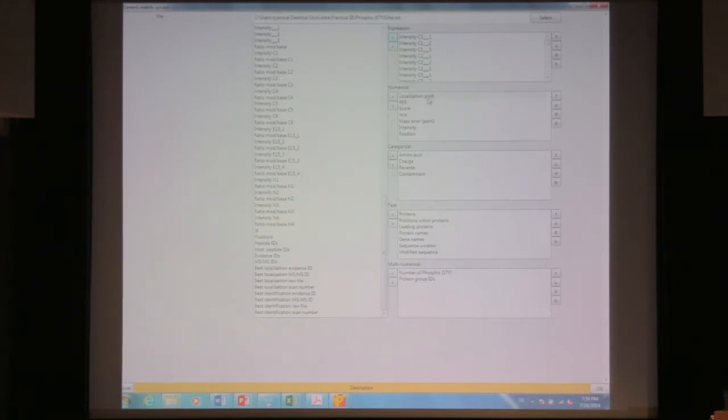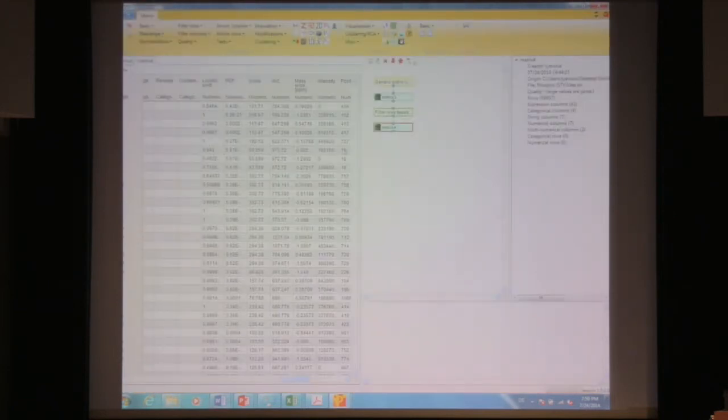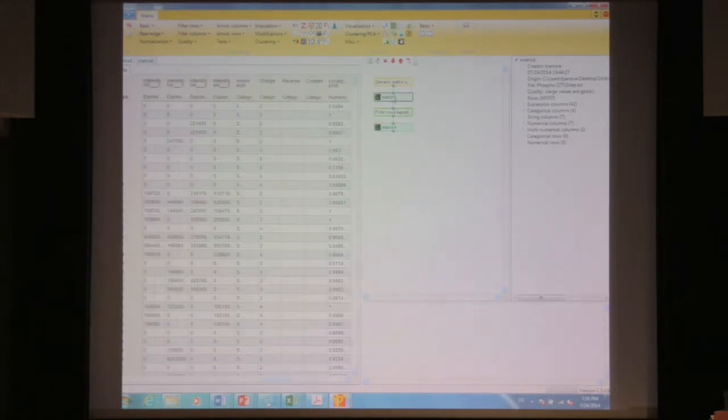Yes, so it's here. If you see where the mouse cursor is, under numerical, it's selected by default. So I'm just saying in case it's not, to make sure it's selected. Okay, I'm not going to do it again because I've already done it in the previous matrix. So we now have the data loaded. Okay, so is everyone with us? Yeah. Okay, so we want to filter the reverse entries. So filter rows, and filter rows based on categorical column.